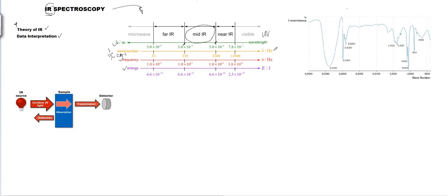Okay, so why is wave number introduced? Because in the spectrum, the x-axis ni dia tak ada wavelength, macam UVVis semua, macam fluorescence. Instead of the wavelength dan sebagainya, dia ada wave number which is in the unit of centimeter^-1, because wave number is 1 over lambda. Okay, so that's why when wave number is higher, automatically the frequency is also higher.